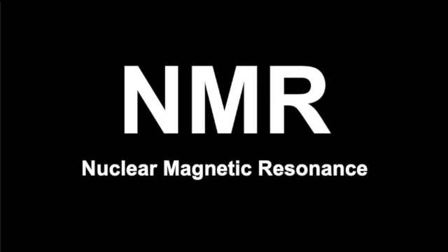NMR stands for nuclear magnetic resonance. And it's nuclear because we're looking at the nucleus of the atoms, not the electrons, the outer negative electrons. So we're looking at the nucleus. There's a magnet involved in resonance just because, well, there's some resonance as well. So here's the basic idea.